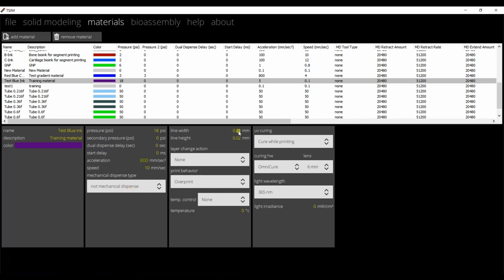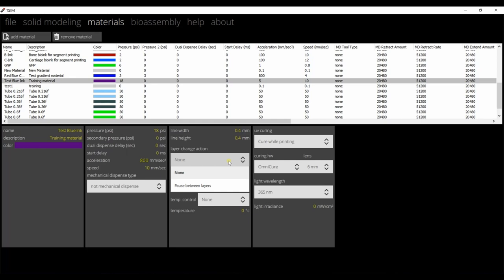Next, the line width and the line height are going to be same as the needle diameter. As we are using 22 gauge needle, change it to 0.4 mm. We can decrease the height by a small amount to accommodate for the compression of layers during printing. We can change the layer action as needed if we need to pause between layers for materials that have slow cross-linking speed. Next, change the print behavior to overprint or underprint depending on the extrudability of the material. Temperature control, change the parameters as needed. Change the UV curing parameters as needed. Today, we will not be needing UV cross-linking.